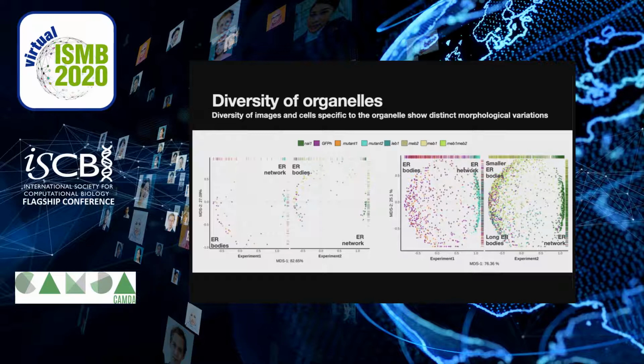One thing to note is that mutant 1 and mutant 2 are different. Mutant 1 has ER bodies but morphologically distinct cells, and most of the samples in mutant 2 were reported to have larger cells but no ER bodies. Our morphological analysis therefore holds true for ER body mutants.